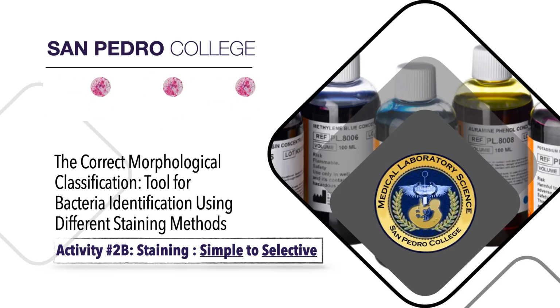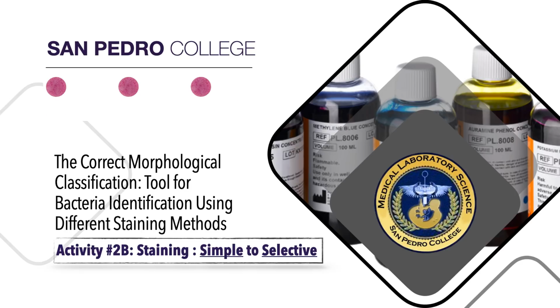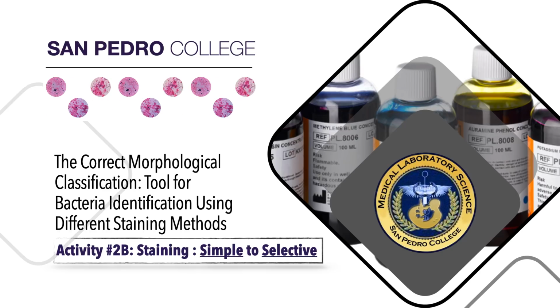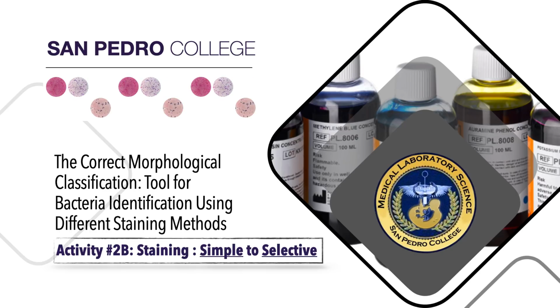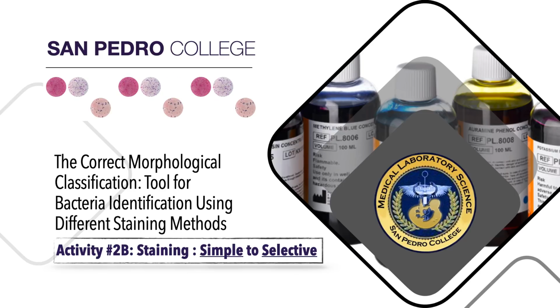Except of course, the pictures I showed where I really stated that these are the bacteria and this is how they would look under the microscope. Those pictures are really how they look. But apart from those pictures, the other things were just enhanced for you to better appreciate the structure and the bacteria themselves.